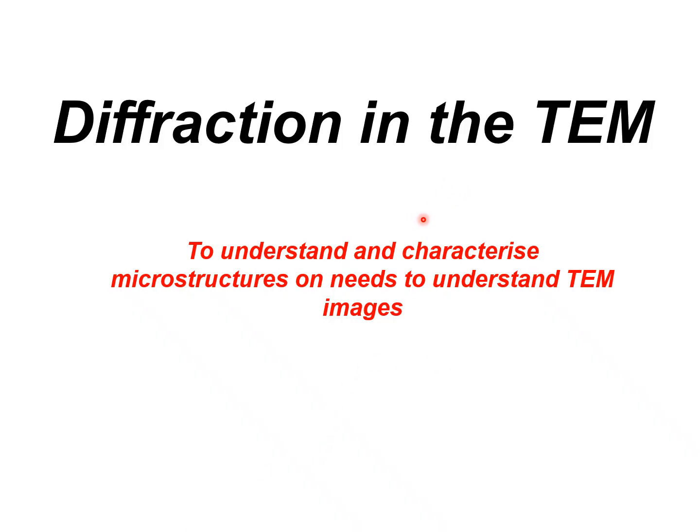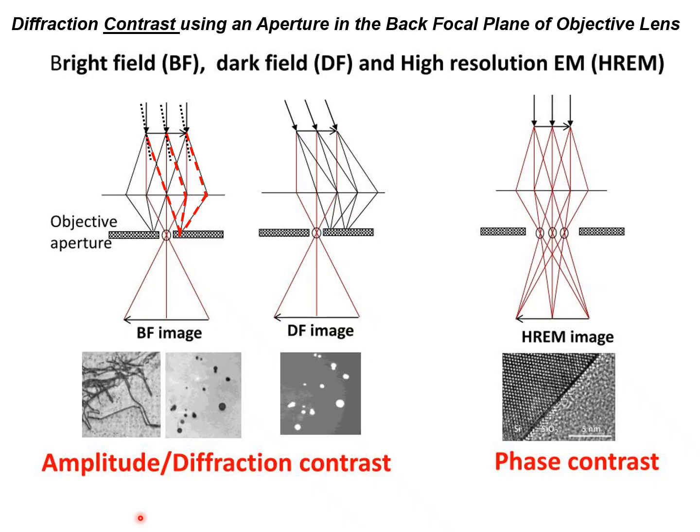Okay, a little bit more about TEM. I gave a couple of other lectures where I talked about TEM theory, but I want to focus more on interpretation of images in this particular presentation. But I'll talk a little bit now about diffraction in the TEM, just as a reminder.